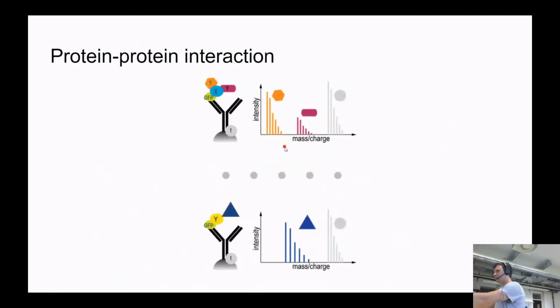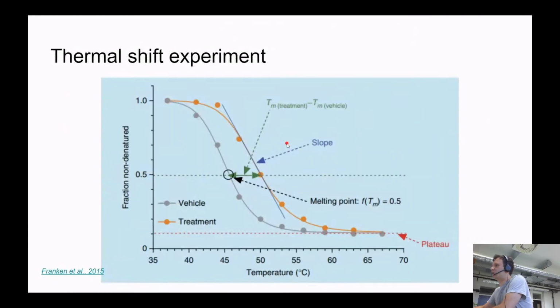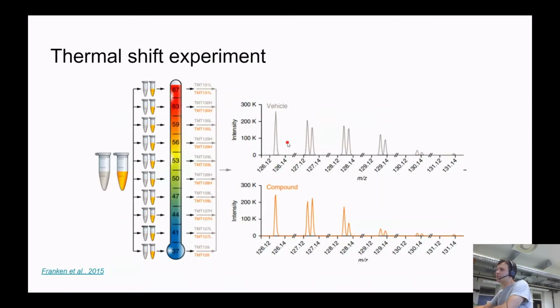Let's say 12 minutes, I probably will describe this topic. It's actually a very interesting experiment. It's called the thermal shift experiment. So what is this experiment doing? Let me tell you what it's doing at the end. At the end, okay, what's the question?